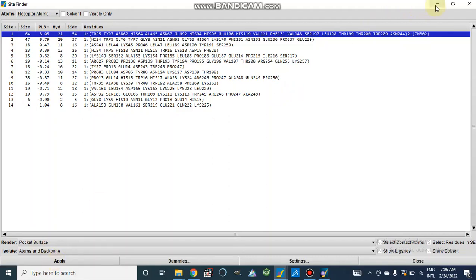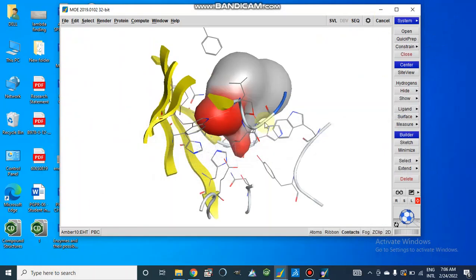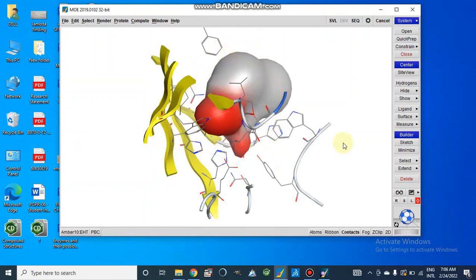After this, we get this one which contains—this is our active site surface. And this is our active site where we can dock our small molecules or compounds.